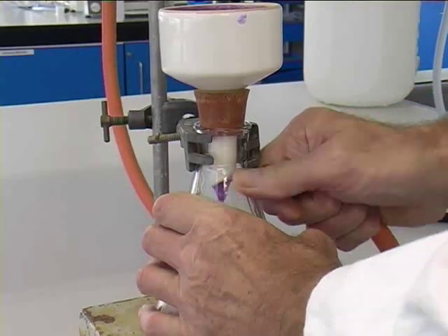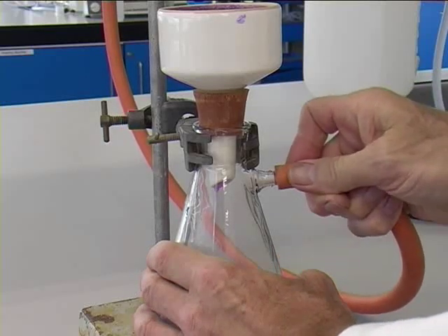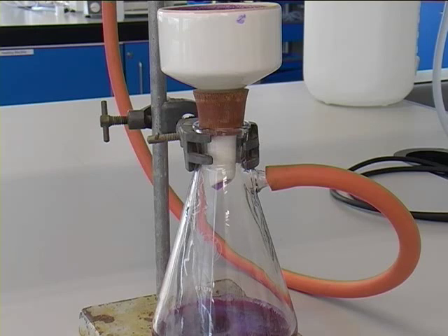If there are problems with the filtration and it is filtering slowly, sometimes it helps to remove and reattach the rubber tubing. As you can see, the filtration is occurring at a much faster rate now.